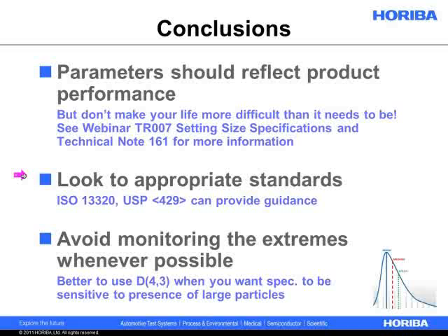I'd also recommend, when in doubt, look to the appropriate standards. That could be ISO 13320 in most cases. If you're in pharma, you'd be looking at USP 429 or the equivalent EP and JP.